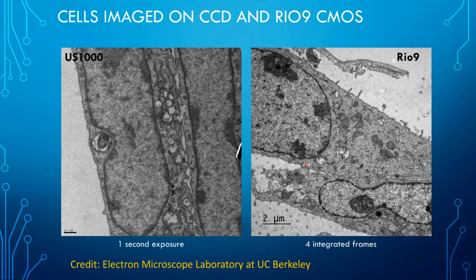In a 120 kV microscope, we routinely for our materials work need to go up to 250 or 300,000 K to do our imaging. With a bottom mount, you're going to be able to take advantage of that full range of magnification, but if it's side mounted, it's a little stunted. So I would recommend, if someone needs to do as diverse a sample set as what we do in our core, where you have to go between bio and materials work routinely, do the bottom mount if possible, because you're going to be able to make do with the real estate that you get, but also take advantage of the full range of magnification of your TEM.